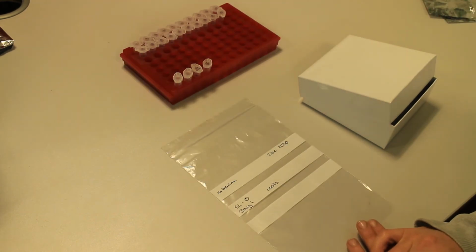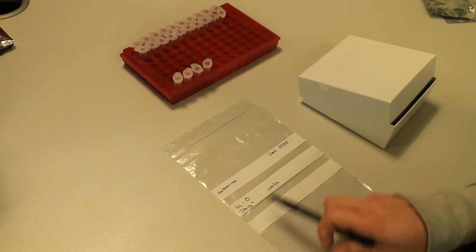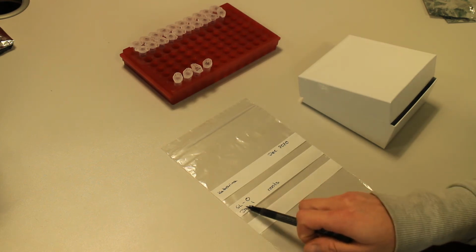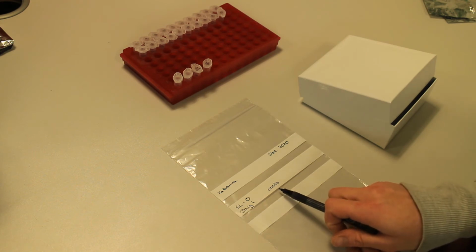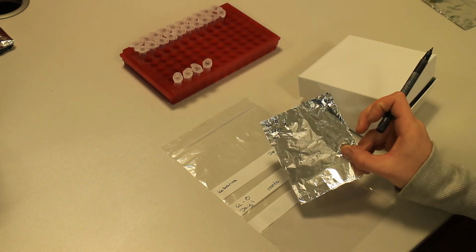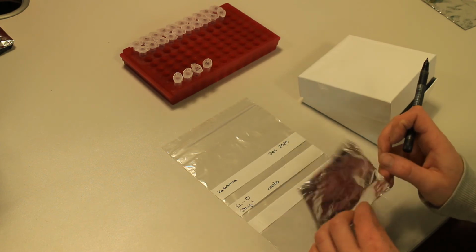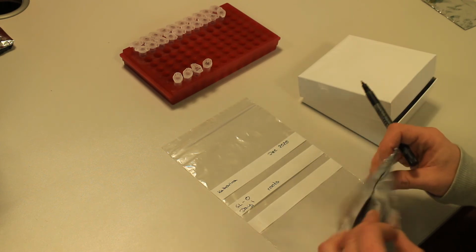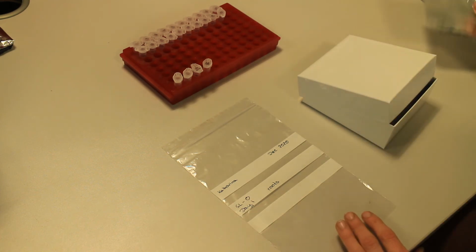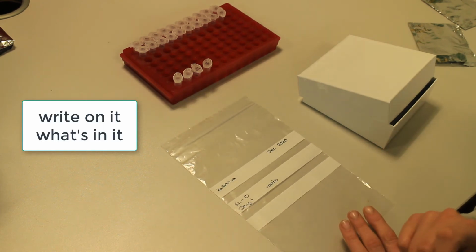If somebody needs to find samples for me now, they can go through it and figure out, okay, these are, if I tell them, oh, I need the root samples of day 1, right, and then they have the experiment, they have the day, they've got the label that it's roots, because if I have them in these bags, you don't know what kind of tissue is in there, right? So if you don't want people to start opening up bags and dropping part of the sample somewhere or mixing samples up because the bags were opened, write on there what's in there. That's the most important thing.